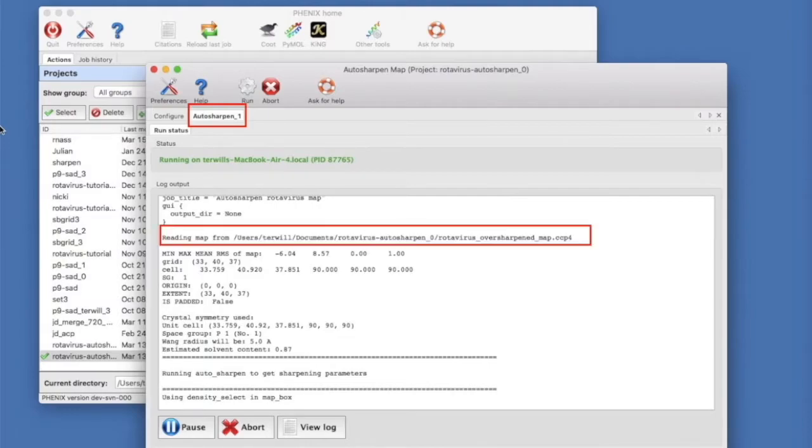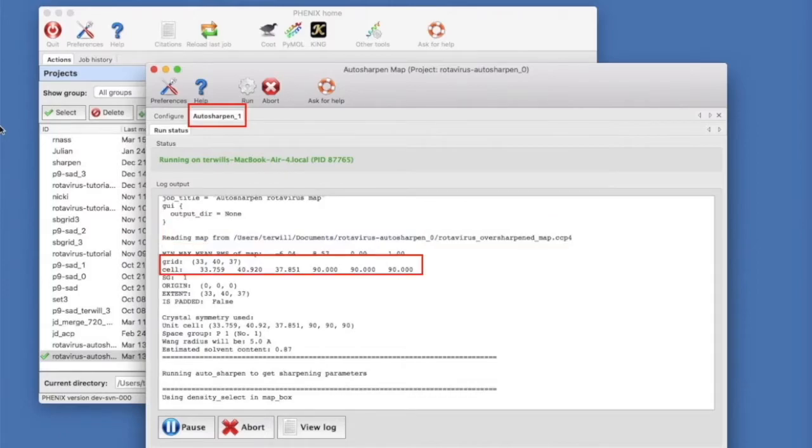Here the log file is telling us about the map that we supplied. Notice the grid and unit cell and make sure these agree with what you expect.